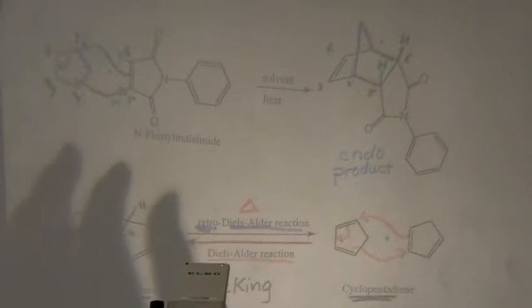Looks really great, okay? So it's like the best looking product that we'll make this semester that you'll actually keep, maybe except for compared to experiment 1, okay? So it looks really nice. It's really easy reaction, okay? But just make sure you follow the steps and spot for TLC when you need to, all right?